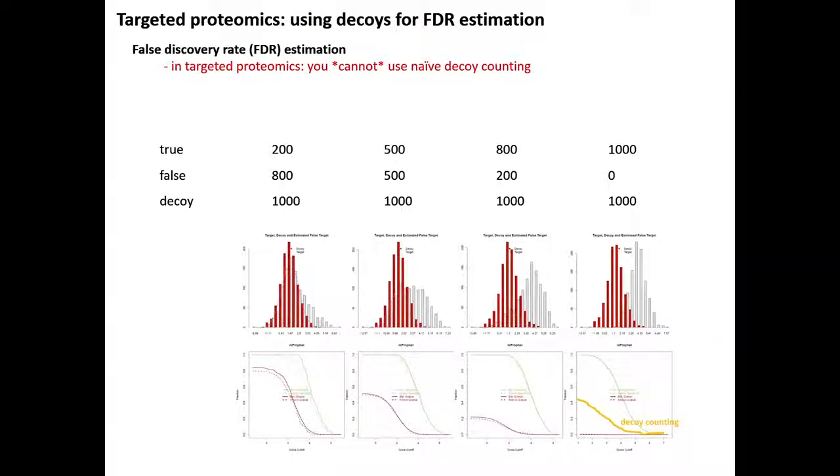But a really nice thing about an LDA is that you can wrap your head around the numbers a little bit. You can essentially apply a simple linear equation to add them all up to recompute the score. When you use more complicated models like a random forest or an SVM, you can sometimes get very good discriminatory power, but it's really hard to interpret whether or not you're overfitting. So if you can use a simple model, it's often better. We've used a support vector machine, but we've added a lot of cross-validation to ensure we're not overfitting, because sometimes we do.